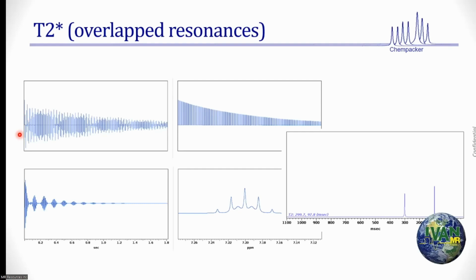The problem with this data is it's all phase convoluted because every time you move, your phase rotates. But guess what? In the time domain, phase is a number. Phase is just a number. I can take every model and simply add that. It says that's what the phase of that model is. I say, okay, apply that phase. So then this is what you actually have. This is an amplitude. This is not just some CPMG experiment. This is the amplitude of that FID as a function of dwell time.